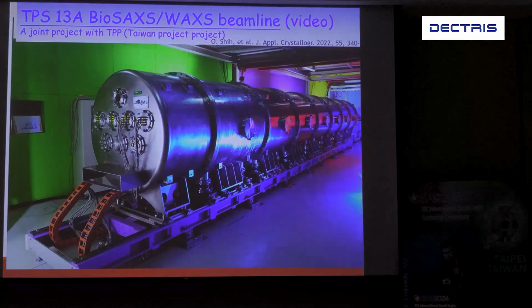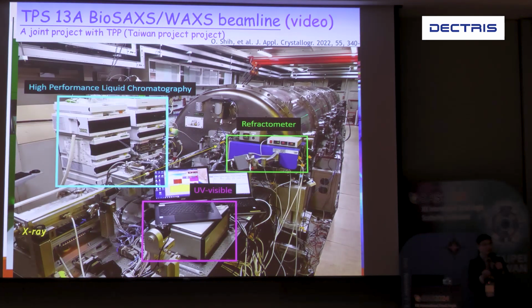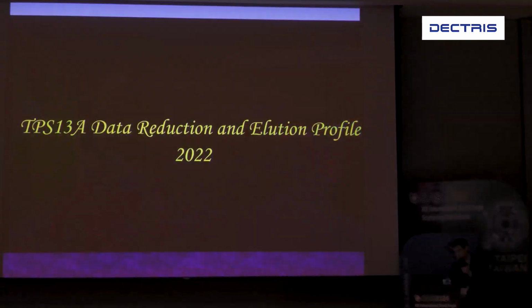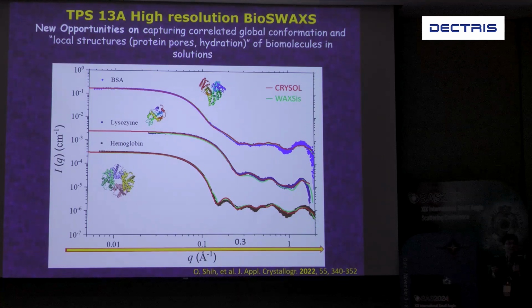Okay, but I would like to say that I think DECTRIS does its job to bring us very good low noise detectors. But the users do the corresponding part. We have to put the detector in vacuum to reduce the scattering noise. So both have to reach that. I will skip this, just instrumentation. So both the detector and the detector environment have to match to bring nice data in the high Q, which very often was blocked by the air scattering.